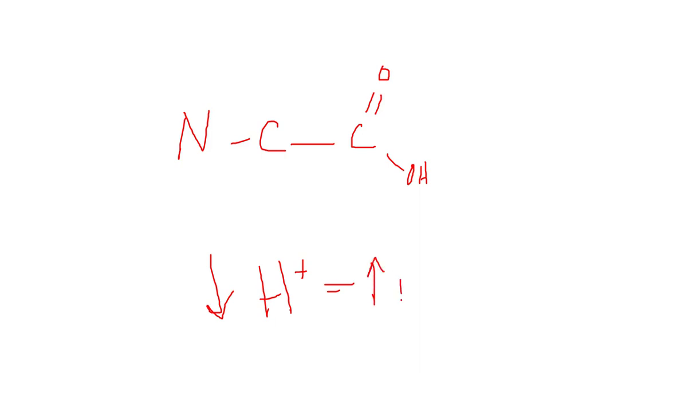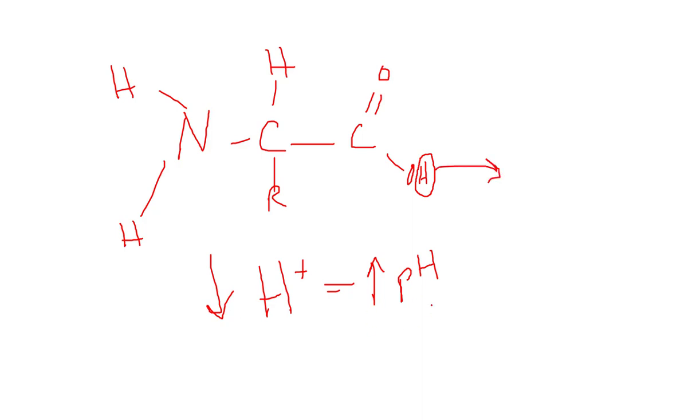So we're using pH 9.2 in this lab. And at a very low hydrogen ion concentration or a very high pH, again, the protein is going to try to buffer the environment. And the way it'll do that is to try to raise up the hydrogen ion. So what it can do is release this hydrogen here. That can be released into the solution to try to neutralize the pH.